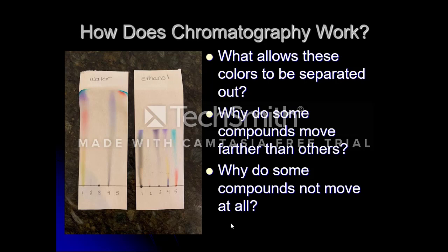And then we have number 3, which does not move at all in the water. And number 2 doesn't really move in the ethanol. So you can kind of see that that happens as well. The Sharpie is the permanent pen, number 3, and it probably doesn't surprise you that it is not going to move in water, because if you've ever tried to wipe Sharpie off of something with water, you know that won't work.